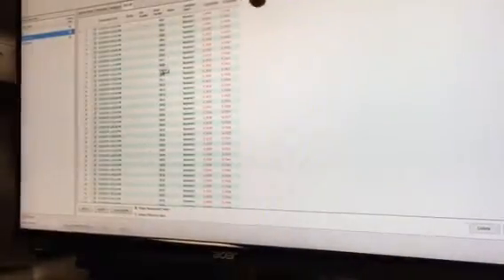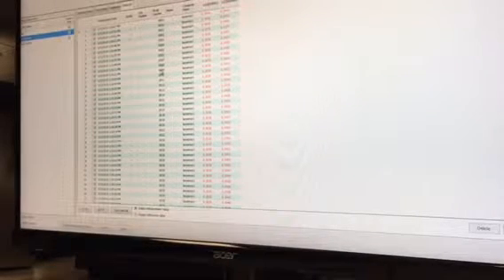And if I combine two programs, all that data will just be... Yeah. But what I mean is, see how this one has your 2 diameters? Right. So let's say we did this one. So we increased the number of parts that it can measure. When you combine programs, you can only run one part at a time. Oh. Because they won't let you switch the parts. But it's fine. You can run it this way and then flip it and then run the other one. Yeah.